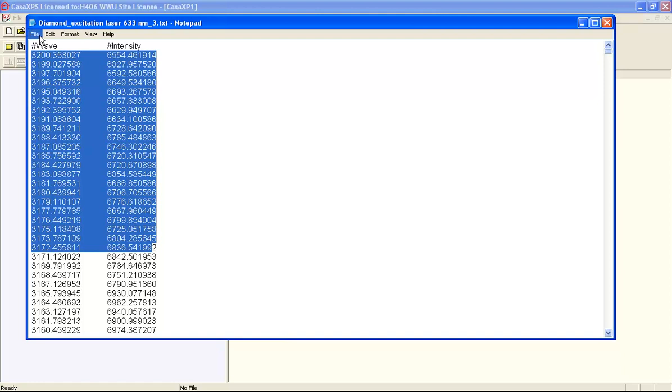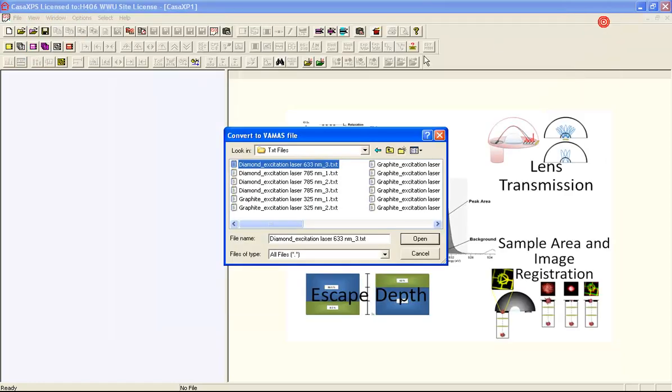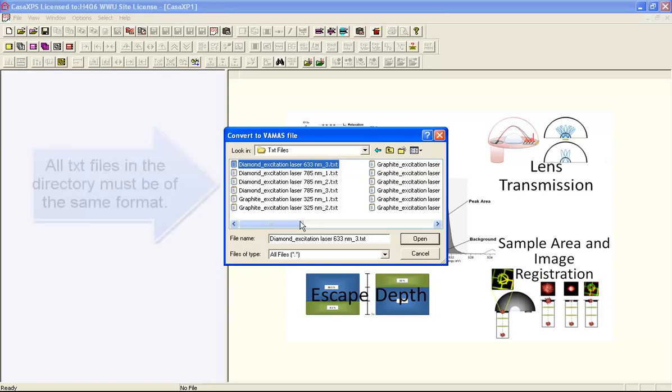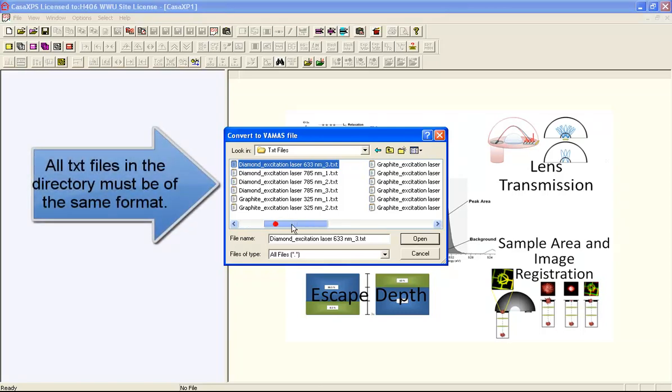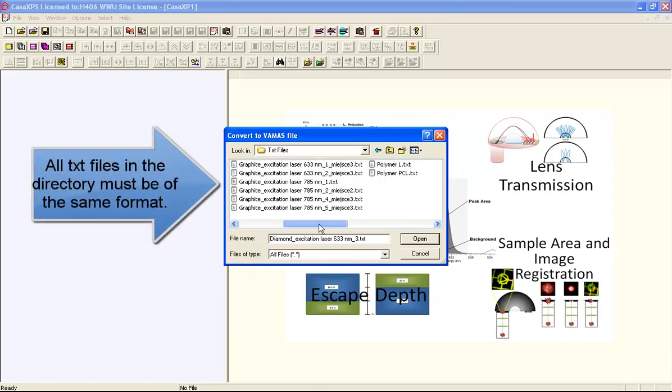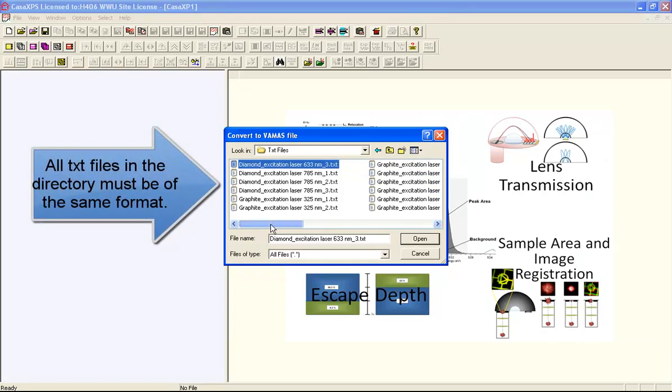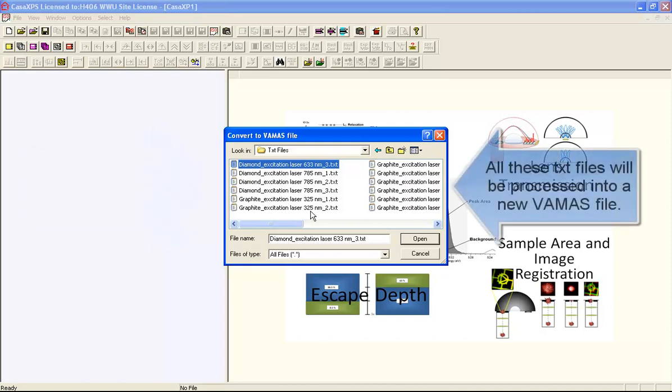So if I have a directory that contains a set of equivalent files all having a single header and irregularly spaced abscissa values for the intensities, then I can collect these into a VAMAS file.